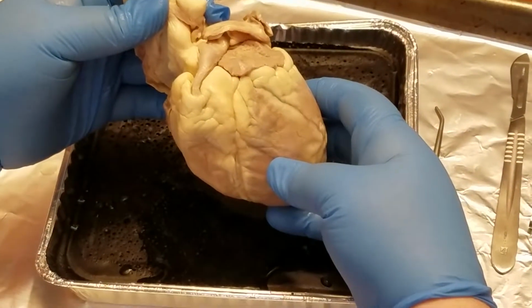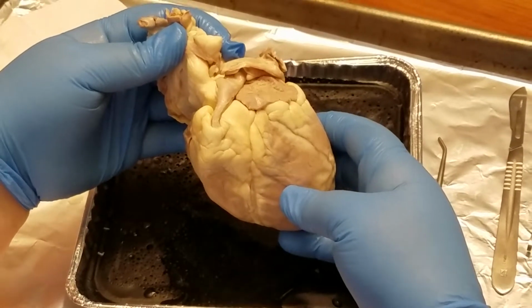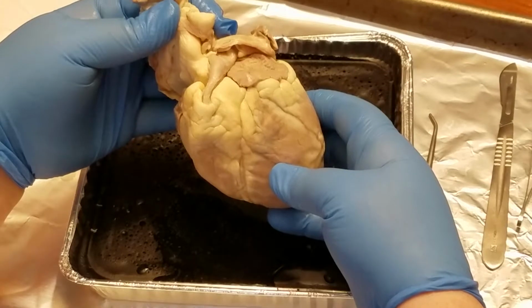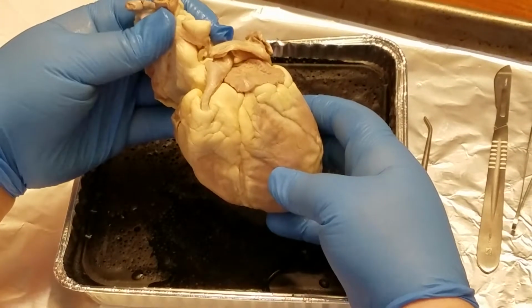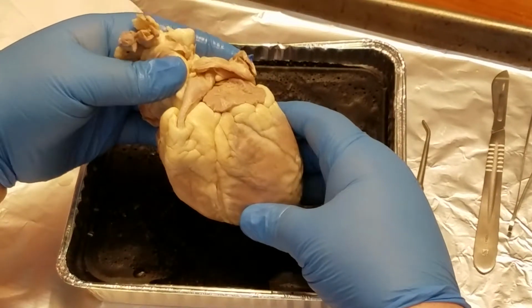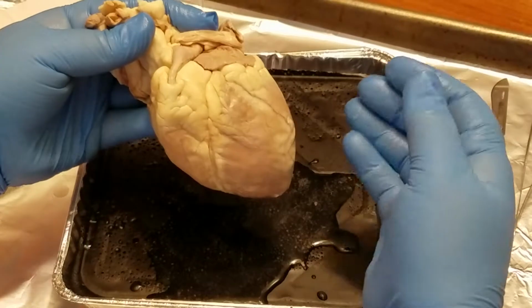Okay, this is CTrautman. This is the sheep heart dissection practical for Biology Lab 221, fall 2018 semester. And before I cut into the organ here, I just wanted to go through the external features. We are looking at the anterior surface of the heart.